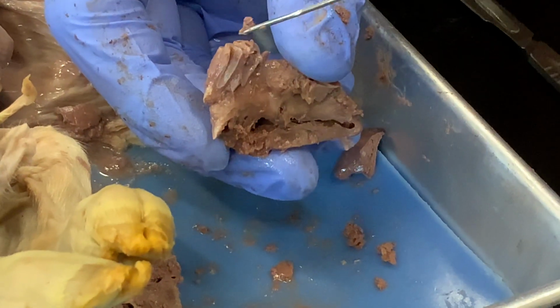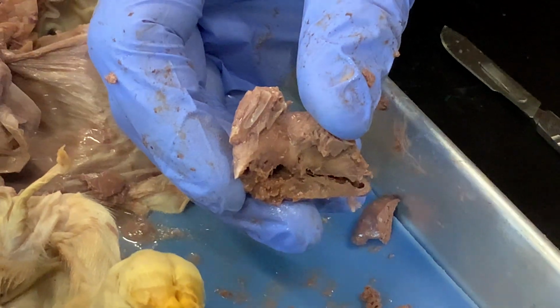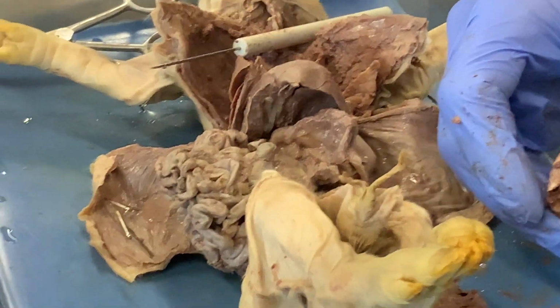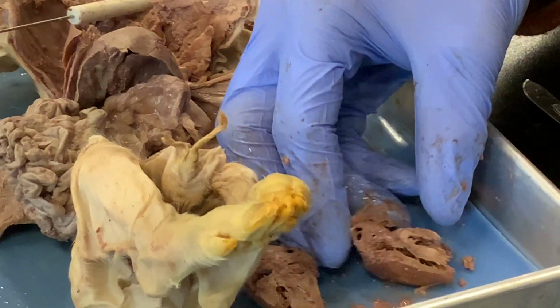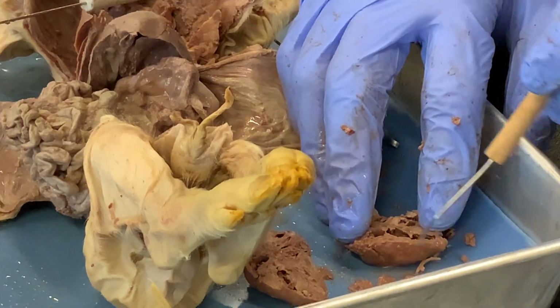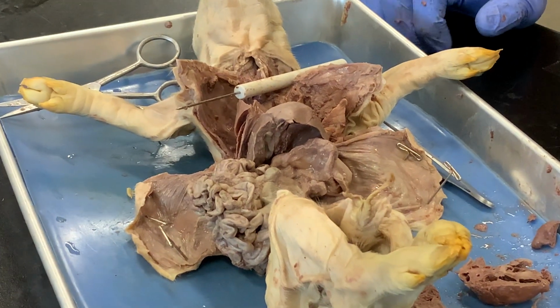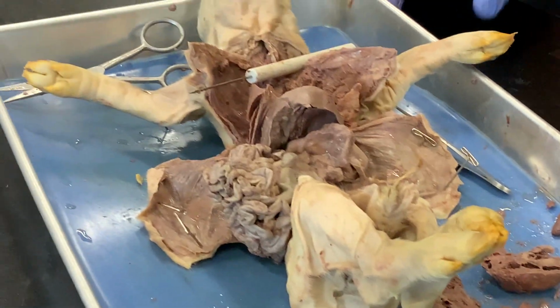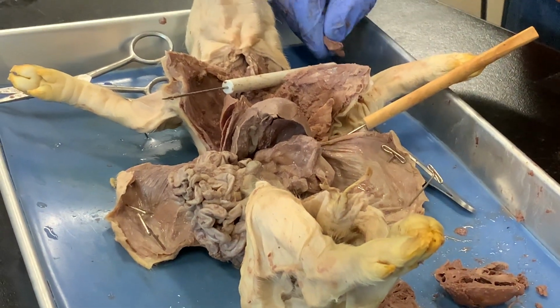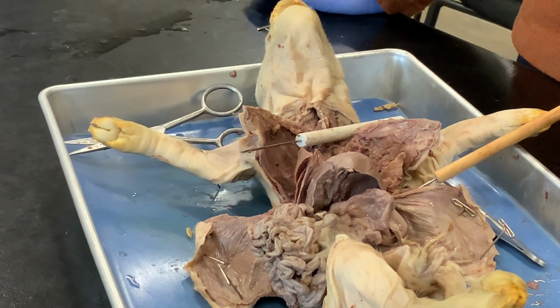Some smaller blood vessels leave it and go up to supply blood to the brain and the forelimbs, so these legs up here. And the rest of it goes down through the abdomen and supplies blood to the internal organs and to the legs. So this is pushing blood out to the whole body that's been oxygenated by the lungs, and that's why it's the biggest, muscliest part of the heart. So you notice that this heart has more chambers in it and is more complex than that of the frog. It's a little bit more efficient to support a metabolism that is quite a bit faster. All right, and that is our pig.